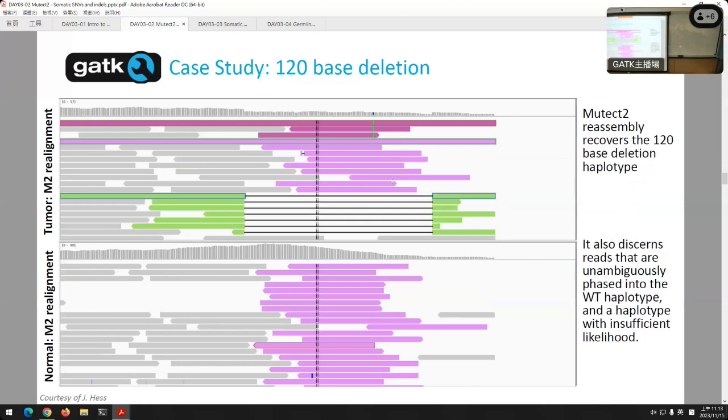So there are cases like this when you're analyzing cancer cells where, by building on top of the haplotype caller, we can get a lot better information about what's going on, including weird deletions like that. There's signal there, as much as it is noisy if you're looking at the actual reads in IGV, but here we can go beyond just saying something's happening to identifying, no, we know what that is now. It was a 120 base deletion.